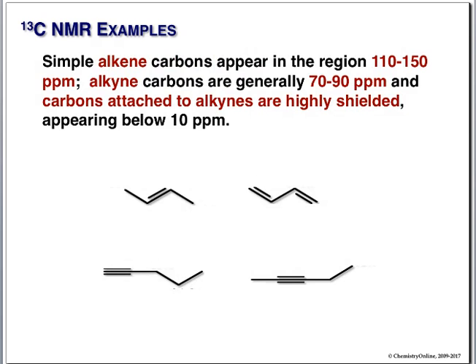Let's look at one final group, and this is our multiple bond group. Remember, these come down below the benzene ring. Benzene rings are the highest in this group. And these will be in the mid-100s, 125 for a simple alkene like this. There's a diene. Interior slightly higher due to steric, 116 on the ends.